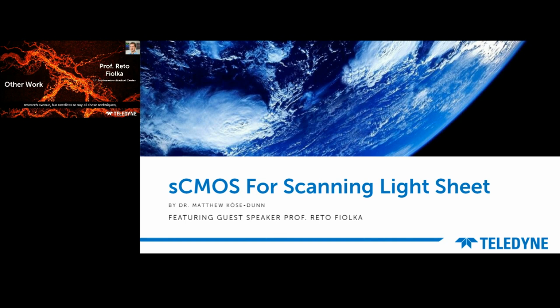But needless to say, all these techniques will benefit from advances in camera technology, like having bigger array sizes, more pixels, and faster readout. I would say, in general, light sheet microscopy will directly benefit from such advances. In terms of speed, light sheet microscopy can be made very fast. Currently, if the sample is bright enough or the brightness of the label allows it, you can essentially run the maximum frame rate of the camera.